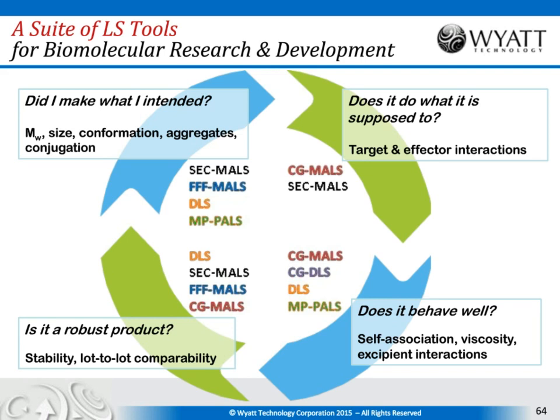Now, Dan, does MALS give the true molecular weight at ultra-high protein concentration, or would multiple scattering and other complexities complicate analysis of molecular weight? Okay. Well, multiple scattering is usually not relevant to monoclonal and high concentration proteins. It turns out that the cross-section for scattering actually decreases as you go to much higher concentrations. So multiple scattering is generally not an issue.